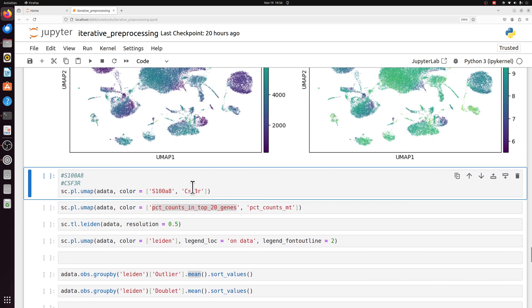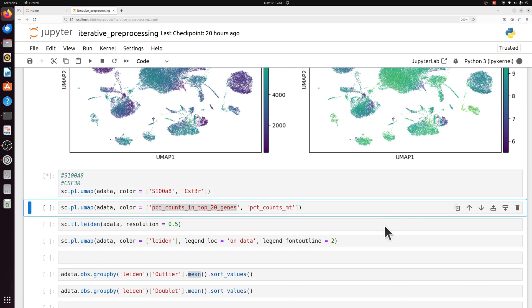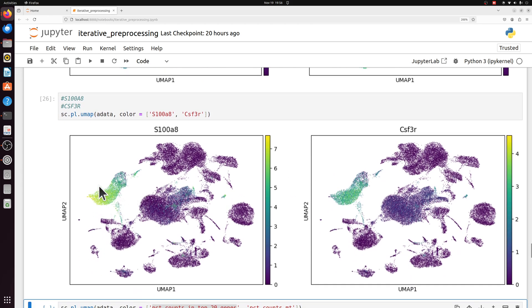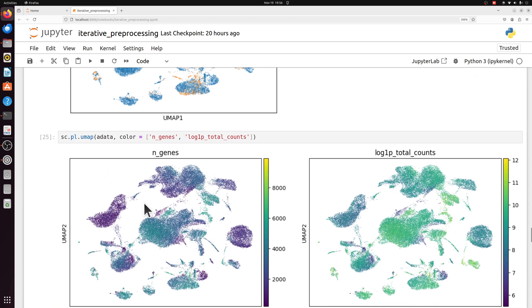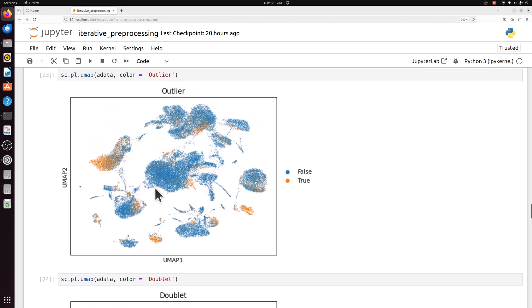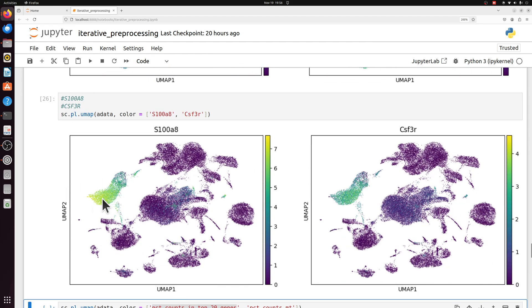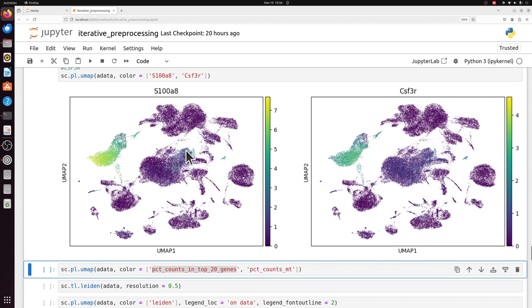So if we look at two of the top neutrophil markers, we see indeed this large population here, which had a lot of outliers in it, is likely a neutrophil population. So we would have actually thrown away a lot of those if we just did the automatic filtering during preprocessing.